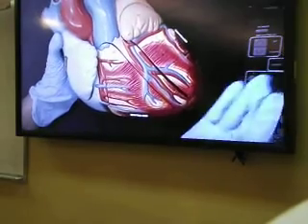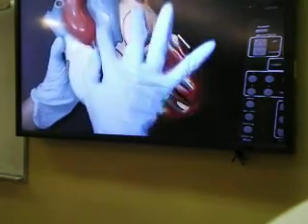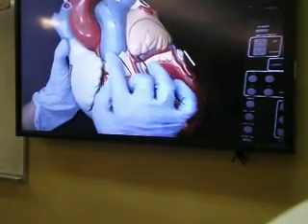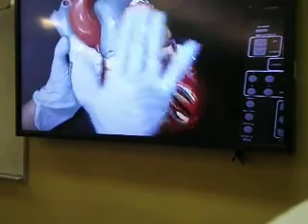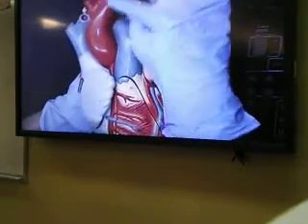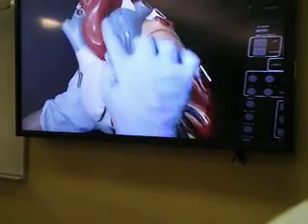And another way we can tell this is the anterior view is that we see these pipe-like structures, which are actually blood vessels, coming directly from the base on the anterior aspect of the heart. All these blood vessels that we are seeing, this one and this one, not this one and this one, these two are arteries.